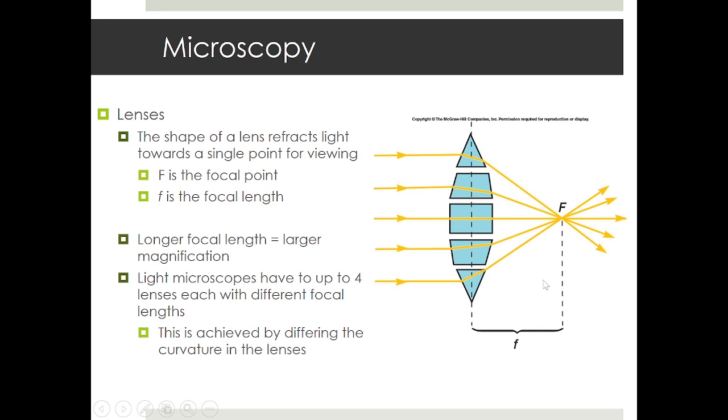And the focal point is something that you'll see often if you're looking into optometry, where if your focal point in your eye is different from how the lens of your eye or your cornea, for example, is shaped, that's when you have blurred vision. Glasses actually function in this way, where they come in and help to correct how light gets into the eye and where it'll actually focus to help to make your vision clearer. And microscopes also have a very similar mechanism, where the lenses that we use will help to concentrate light in such a way that we're able to have a common focal point and really see our specimens crisply and clearly.